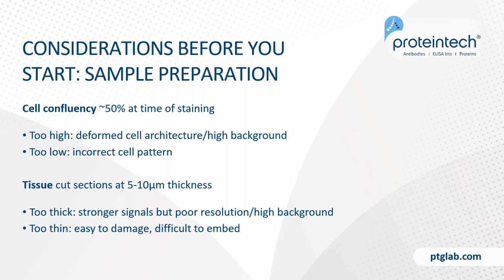If they're too low, then you might get incorrect cell patterning. Some weakly adherent cells require the glass surfaces to be coated, for example with gelatin, in order for the cells to stick.